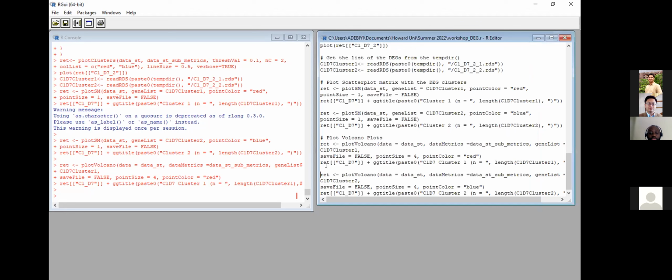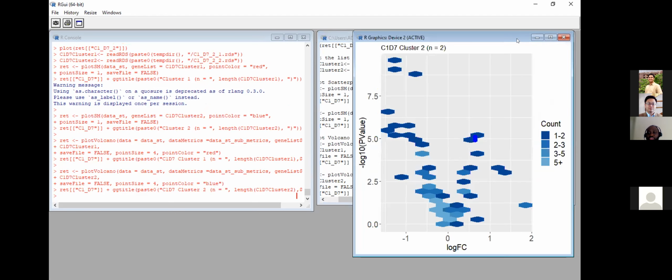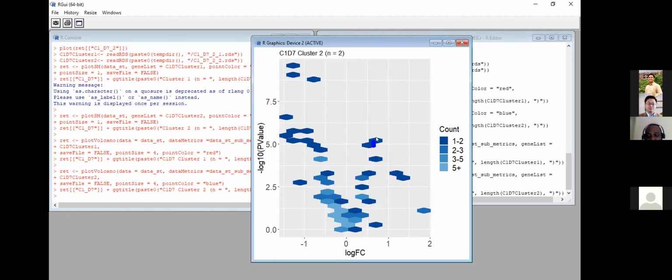Without wasting much time, let me just show you that for downregulated. Since it was just two, all right, this is just two. So you could see the blue color. I know the blue against the blue background is not really visible. You can see these two genes. They're very close to one another, and they're kind of farther away from the midline, which is this zero, compared to the other one. So these are the different figures.